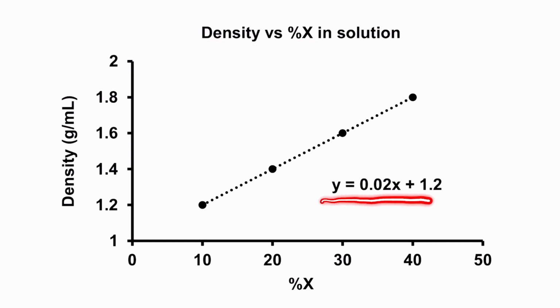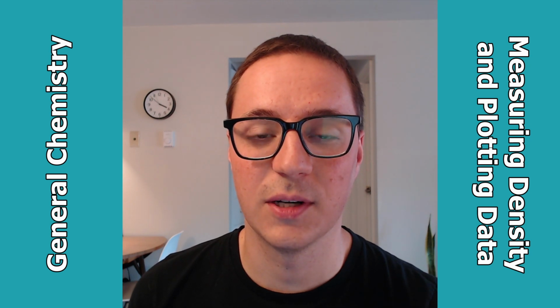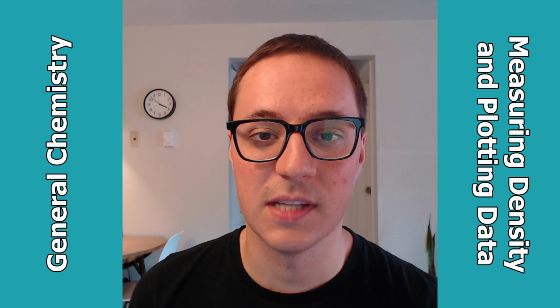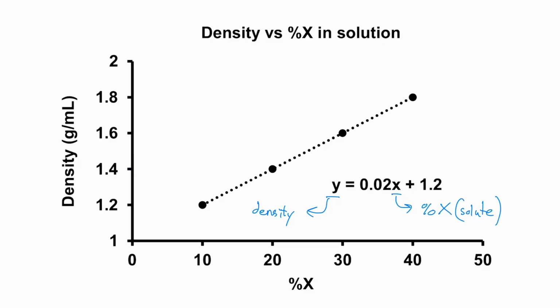The equation of the line mathematically represents that relationship. For this equation, y corresponds to the density, and x corresponds to the % solute. This plot can be referred to as a standard curve, since it's composed of points that we already knew both variables for. The standard curve allows us to figure out variables that we can't measure directly.